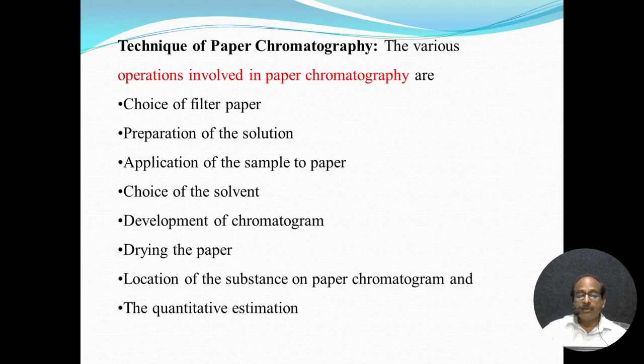The technique of paper chromatography involves the practical choice of filter paper, preparation of the solution, application of the sample to the paper, choice of the solvent, development of the chromatogram, drying of the paper, and quantity estimation.